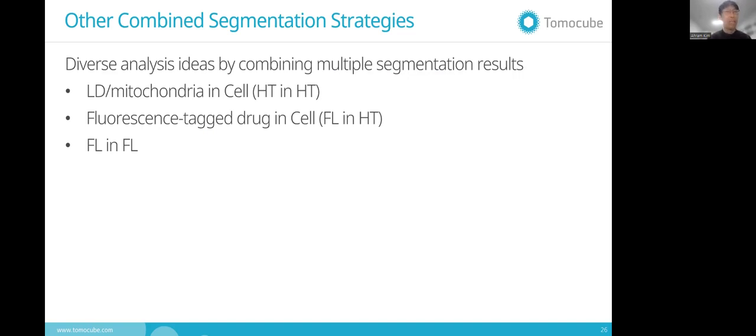Other than that, you need to use many basic fluorescence stains to stain the cells or nucleus, because you need separation between the targets based on the cells. But when you use holotomography, you don't need that kind of extra stains.